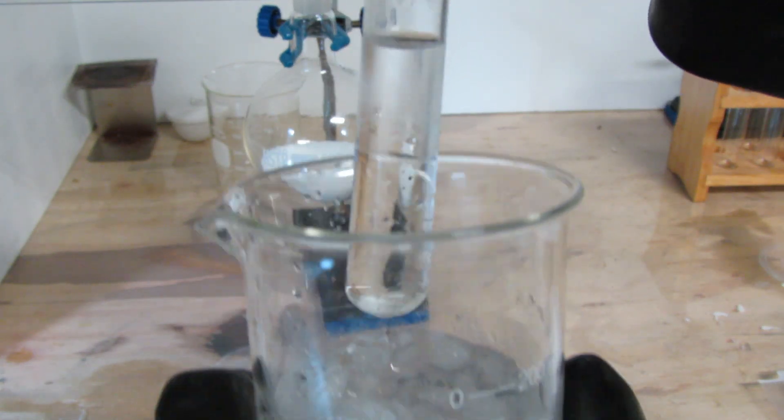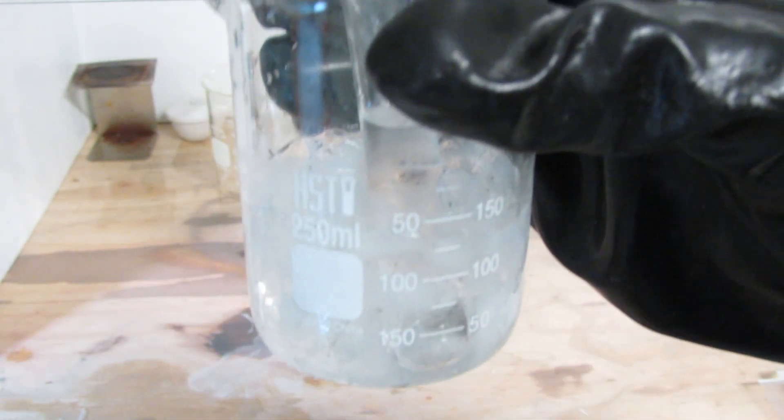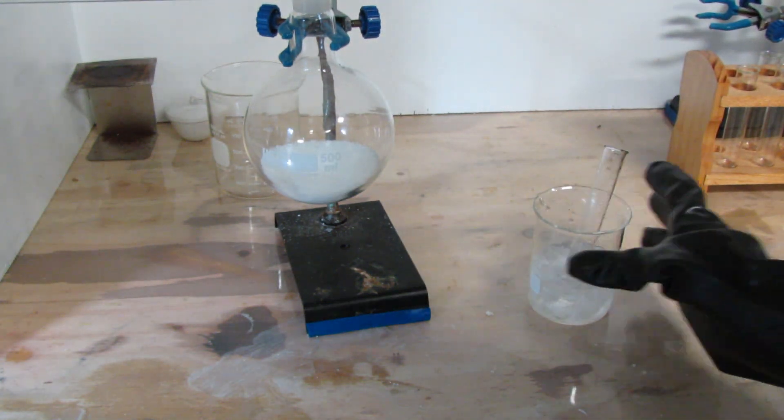Now get a test tube and fill it up with a small amount of water, and place the water in an ice bath. I am just using a beaker with some crushed ice and water. This will help the hydrogen chloride dissolve.